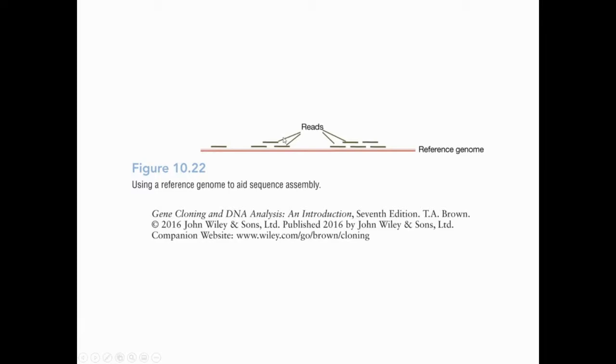And also when you assemble this sequence, normally you need to have a reference genome so that you can correctly identify and place those reads in the correct place.